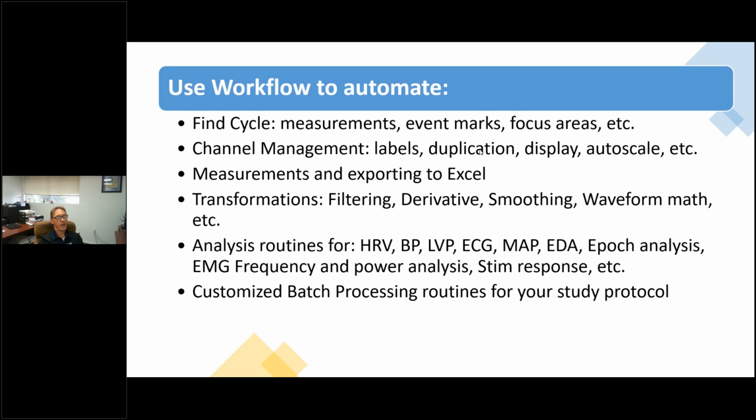So with the workflow, you basically have full control over any of the menu items within AcqKnowledge. So for those of you that use the Find Cycle Detector, you have full access to that. You can tease out event marks, you can apply event marks, you can operate just over the focus areas, just as we've seen. You have what we call channel management, so you can duplicate waveforms, you can add new labels, you can change the display, you can turn channels on and off.